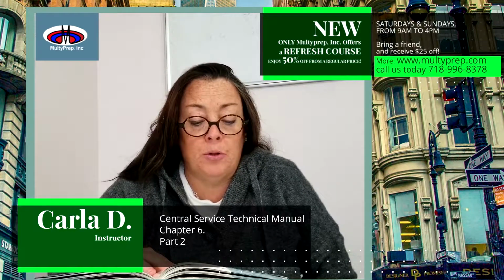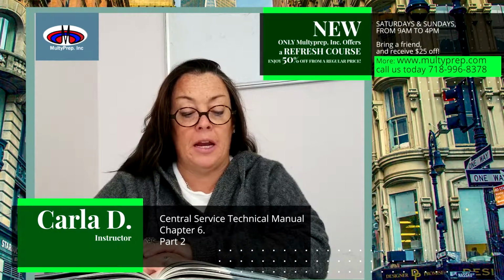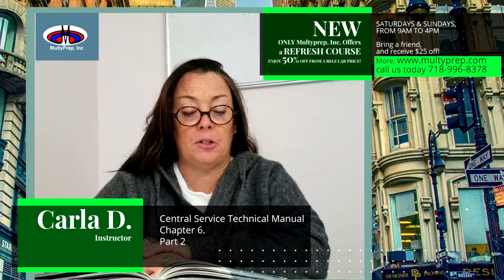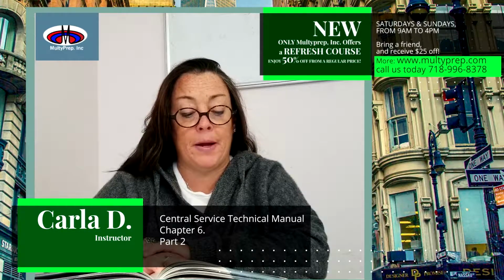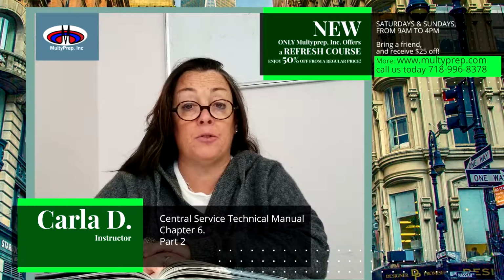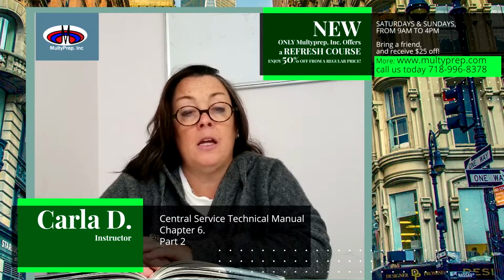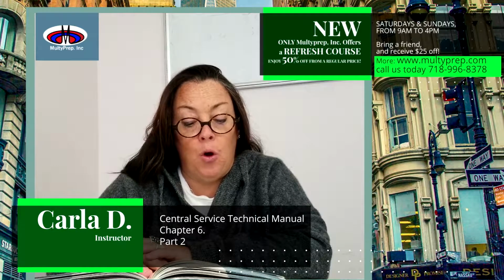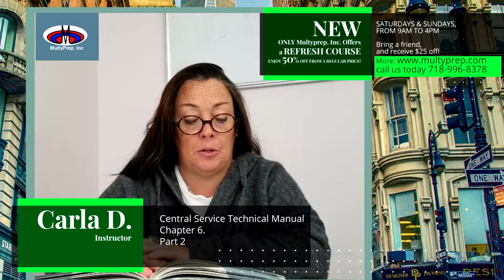Horizontal work surfaces, such as counters and work tables, should be cleaned at least daily and preferably every shift. Light fixtures or their covers and air vents should be cleaned at least every 6 months or as necessary. This function is usually performed by another department such as environmental services or plant maintenance. Finally, other surfaces including walls, cabinets, and racks should be cleaned on a regular scheduled basis.